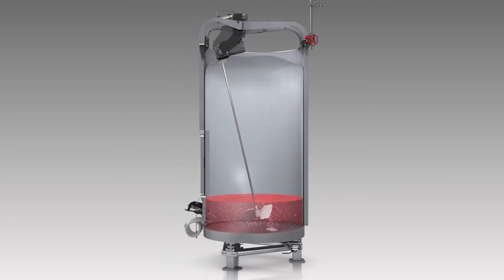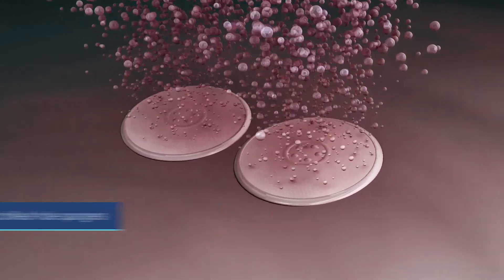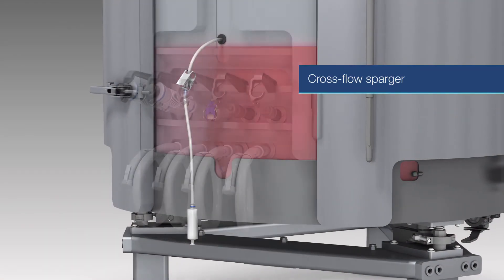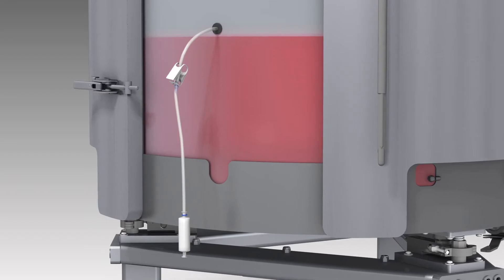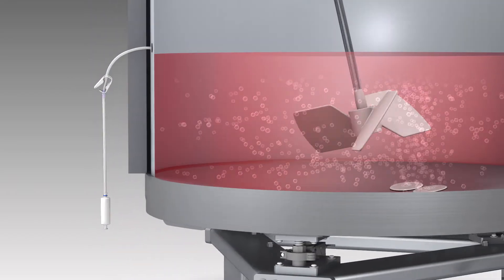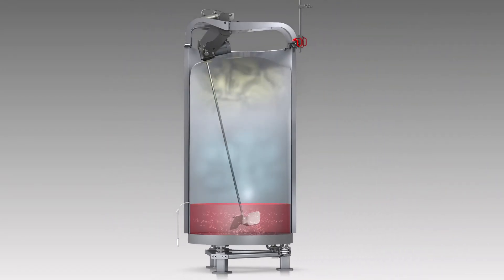BPCs for the 5 to 1 SUBs are equipped with bottom-mounted drilled-hole spargers and a new patented cross-flow sparger for low-volume mixing. The cross-flow sparger is located just above the liquid level, allowing for mixing of the headspace gas and reduction of carbon dioxide levels in the headspace and in solution.